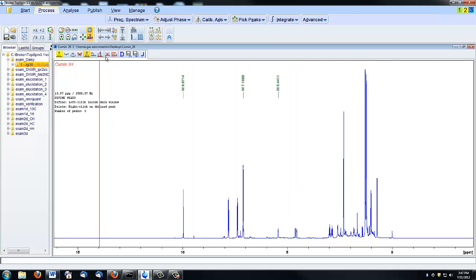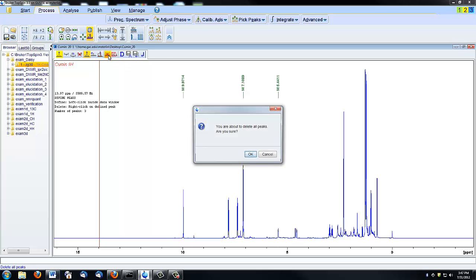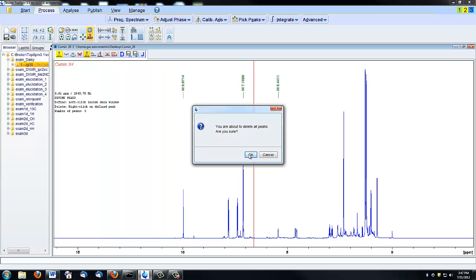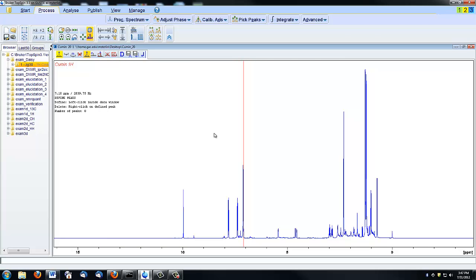If you wish to delete all peaks that you've selected, click this button.